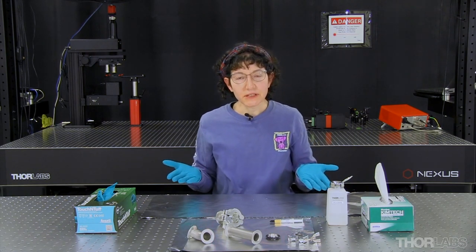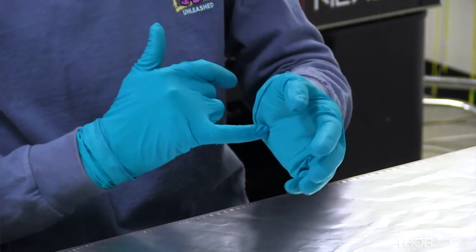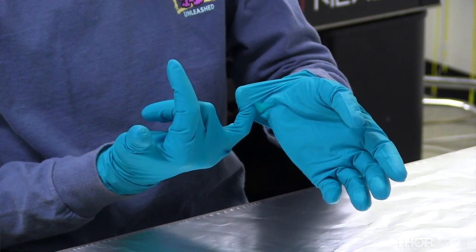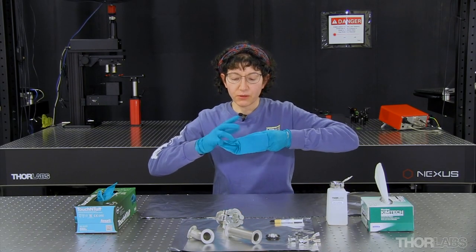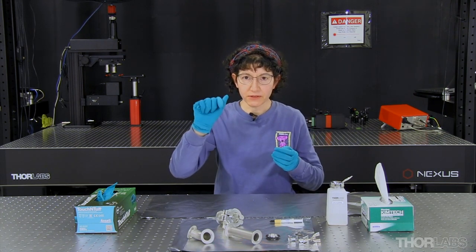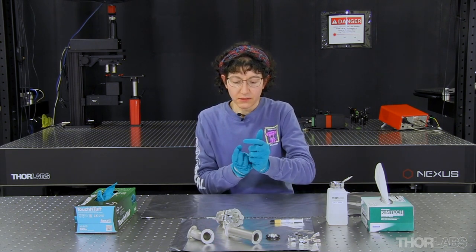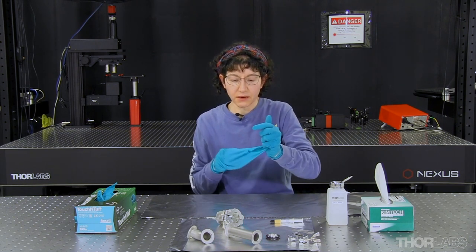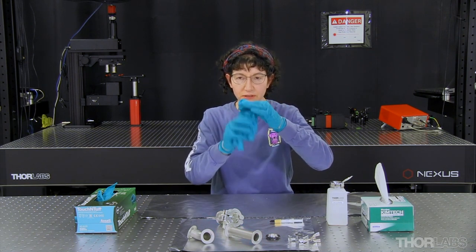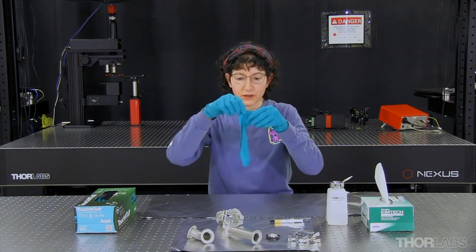If these gloves were contaminated, the way I would take them off is to use the pinky of one hand, hook it under the cuff of the opposite hand, and then pull it off inside out. While pulling it off, I use the opposite hand to gather up the contaminated glove into my fist, then use the pinky under that cuff to pull the second glove off. Now all the contamination is contained within this package, which can be disposed of, and then it's time to put on another pair of gloves.